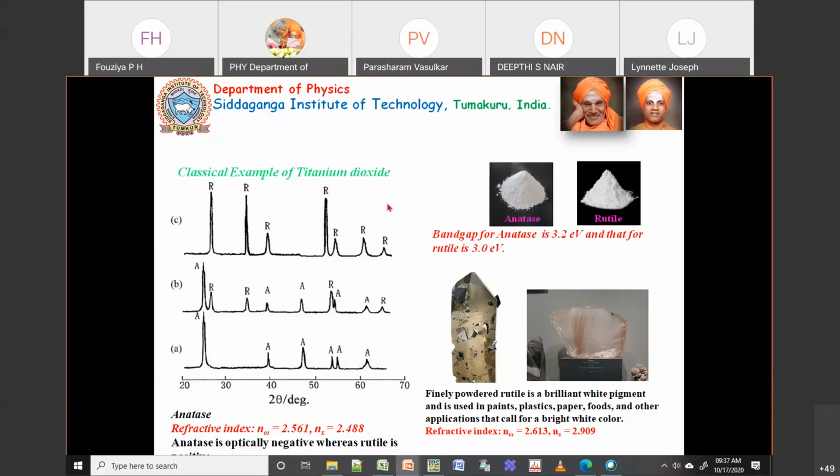before you start any further analysis, or even before starting your main applications. That is the reason why we are going to do phase identification. When you do phase identification, you also get basic information like your space group and your lattice parameter. With this idea, you can go further to profile matching and Rietveld refinement. This will be your starting point. That is the main reason why we are going to do this phase matching.